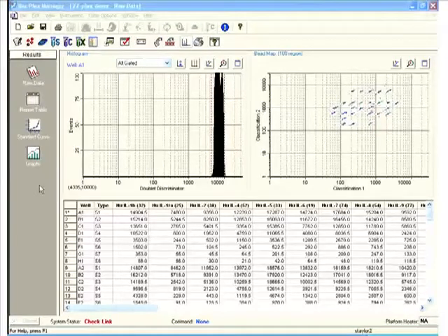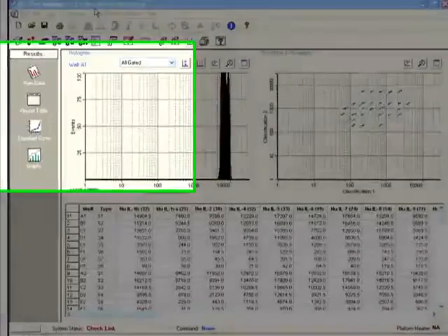In the previous video I showed you how to operate the system and load the plate, and now in this video training I'm going to show you how to actually use Bio-Plex Manager to analyze the associated data from a high-plex assay. In this example I've opened up a data file. It's a 27-plex assay, so 27 cytokines analyzed per sample on a variety of human samples.